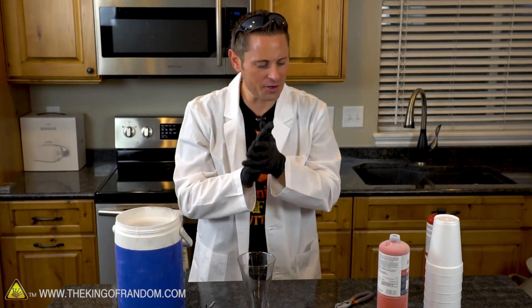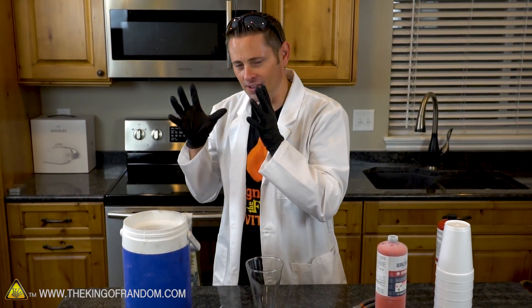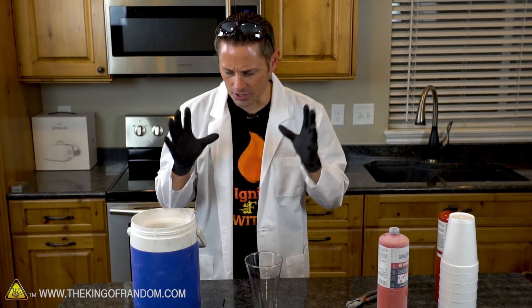Okay so that was a little anti-climactic. So yes, apparently theoretically it is possible to extract liquid oxygen from one of these canisters. However for $11 of oxygen and the cost of liquid nitrogen, we got such a little amount I don't even know if that was worth it. So for this last experiment I'm going to show you the method that I love to use the most for making liquid oxygen.